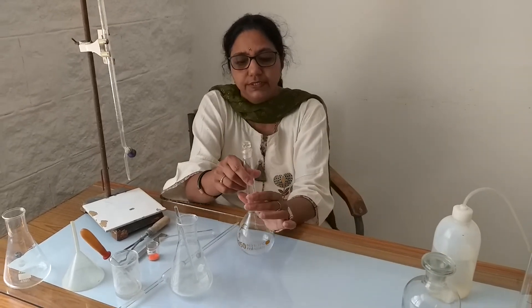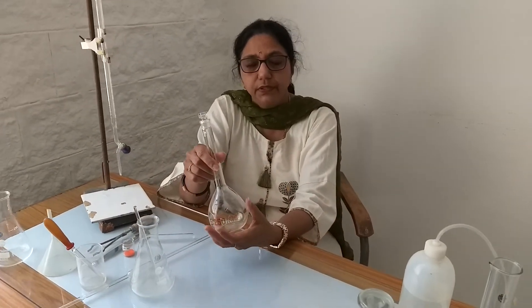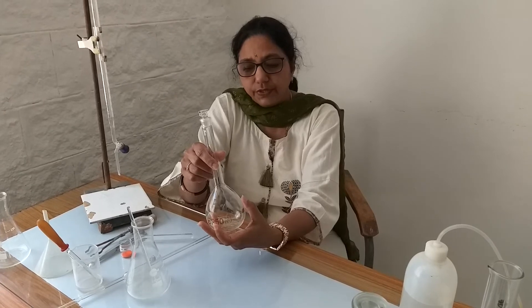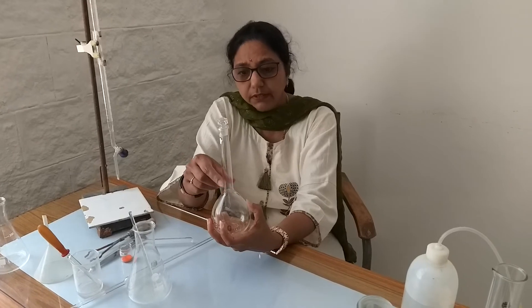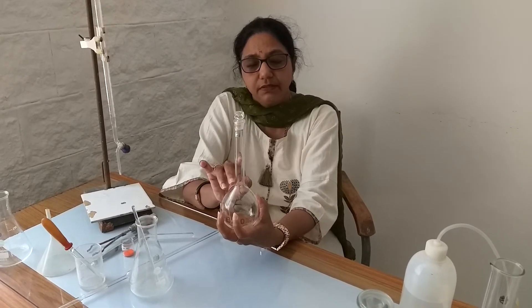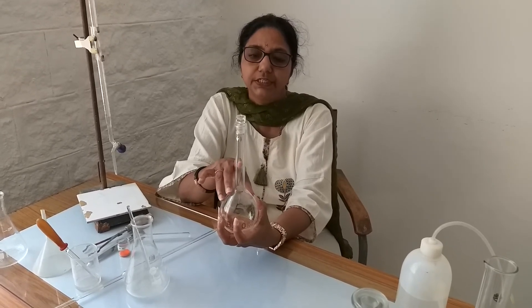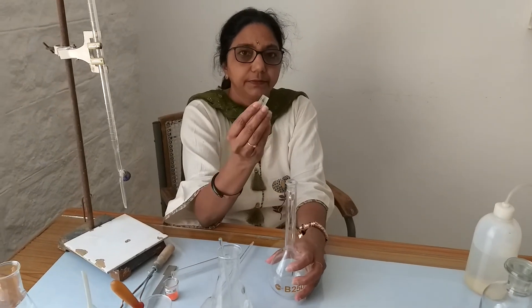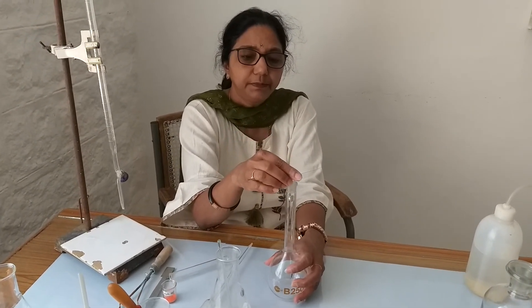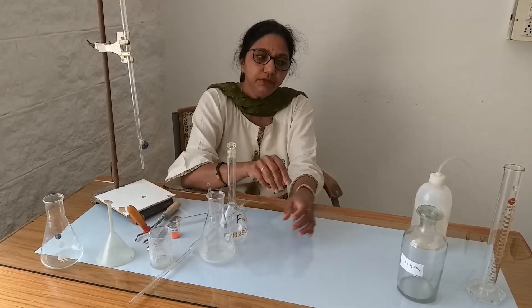This is a standard or volumetric flask. The lower end is modified into a pear-shaped structure and the upper side has a long narrow neck. There is always a mark on the volumetric flask. Whenever we are preparing a solution, it should always reach up to the mark, which indicates the capacity of the solution. It is always provided with a lid, and after making the solution up to the mark, it should be mixed thoroughly to make the solution homogeneous.